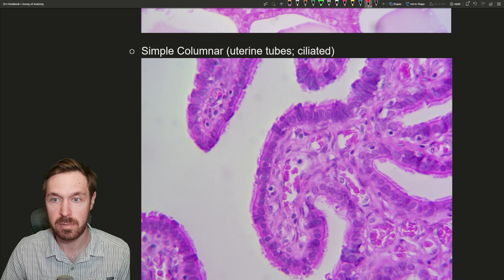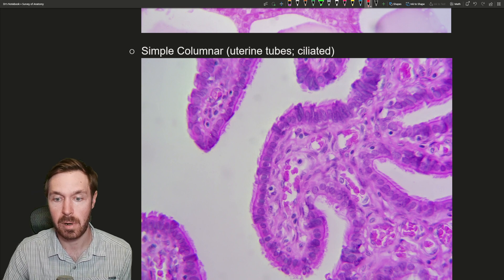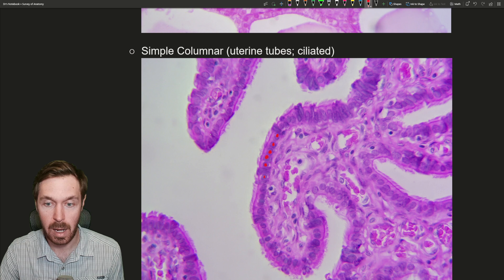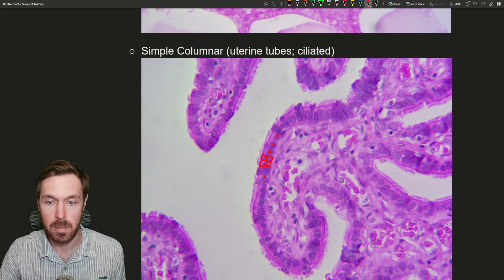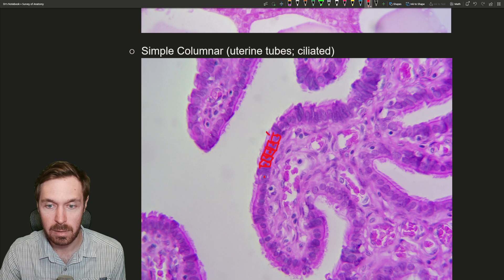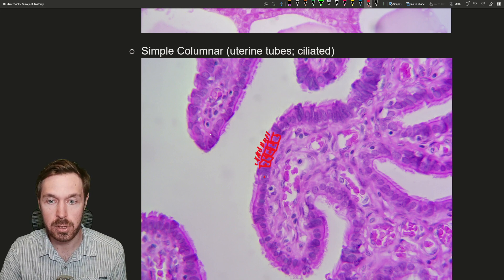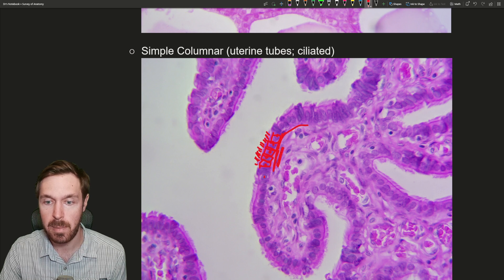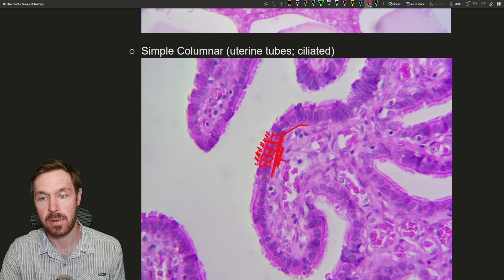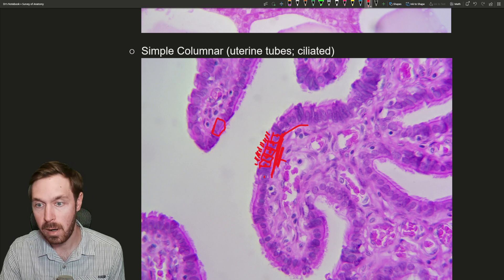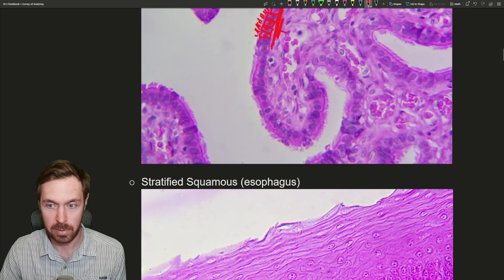Next is simple columnar. This example is from the uterine tubes, or fallopian tubes, which are also ciliated. You can see the nuclei all stained and lined up in the same direction. There could be some mucus-producing goblet cells found in here as well. These all form column-like cells in a single layer. The little fuzziness on the outside is the cilia, so these are ciliated cells. Down below is connective tissue — the basement membrane — and we're focused on this epithelial layer right here.